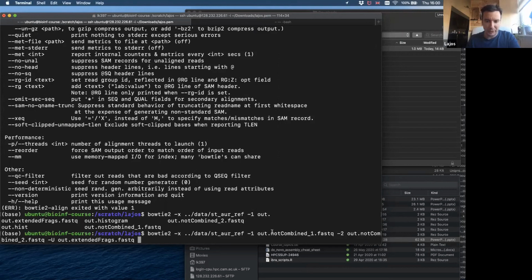If you haven't been here when we did this, Jenny, the extended fastq file is those reads that were overlapping in the middle. So when you are doing paired-end sequencing, sometimes because of your library size, the two reads can actually sequence the same thing in the middle, because the sequencing is going from the two ends into the middle, and we used a program that is detecting these overlaps and makes one read from the two by merging them.